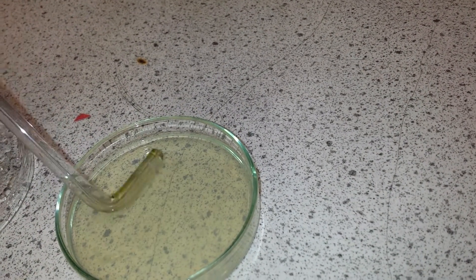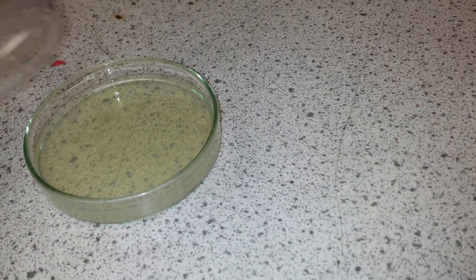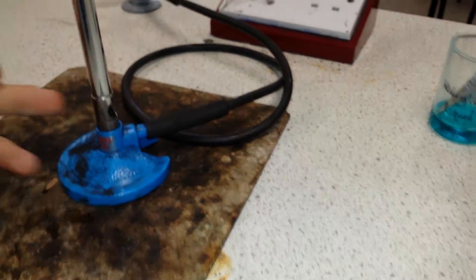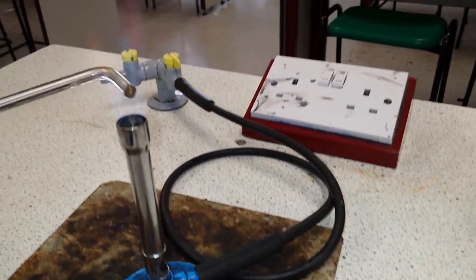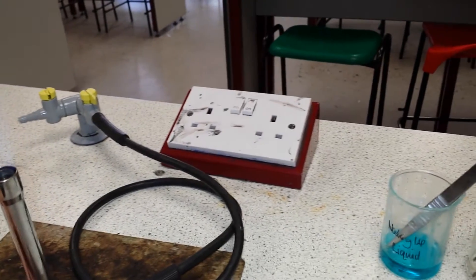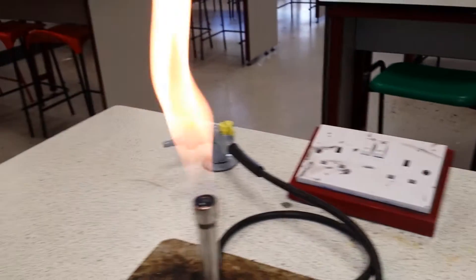We've now got a place for our bacteria to live. We put the lid back on, go back to the blue flame, and kill off any bacteria that is still on the inoculating wand, then return to a safety flame.